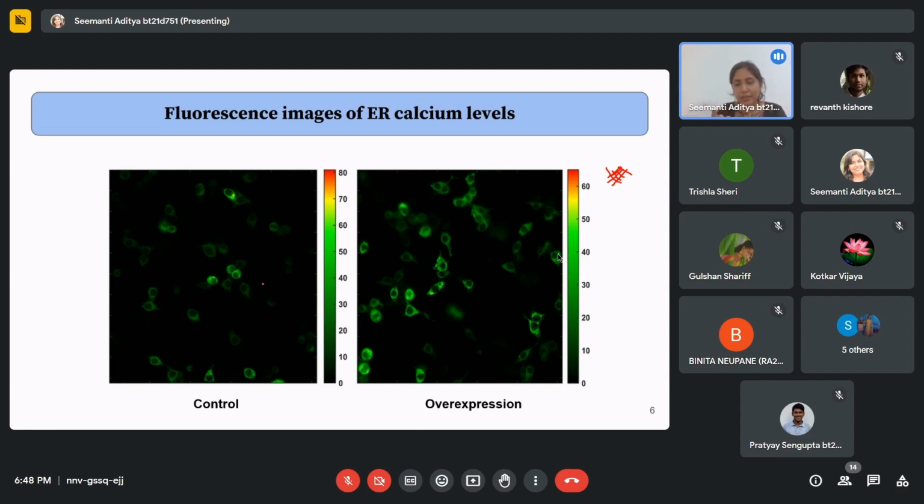For cell death, there are different staining procedures, annexin PI staining or FDA PI staining. If cell death has happened, it will show red color; if it has not happened, it will show green color. It is a very interesting technique to use in different kinds of experiments, and I feel personally that it is very enjoyable to image the cells and show beautiful colorful images.